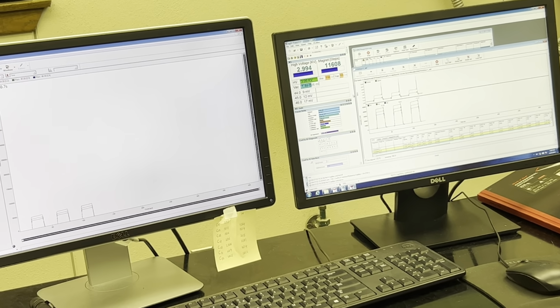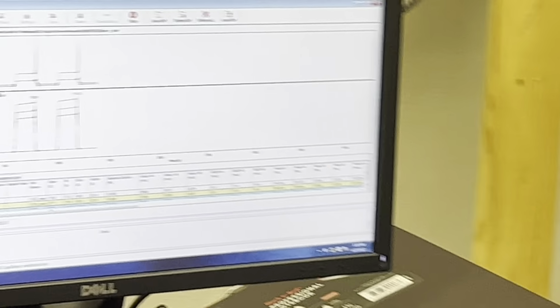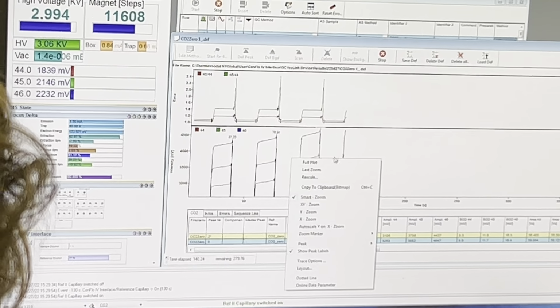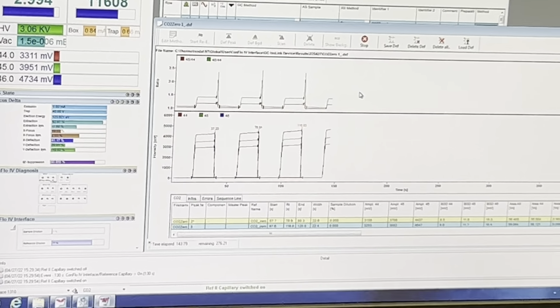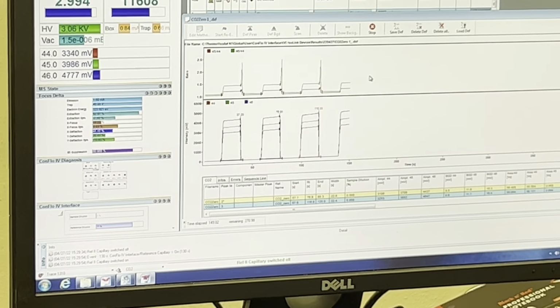Those peak shapes don't look like the best. Still not the best. See how they kind of ramp up? So the flange. But, I mean, that's to be expected. This is the first set. So ideally those look flat? Yes.